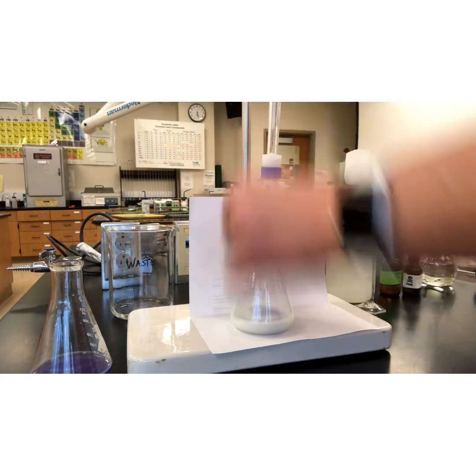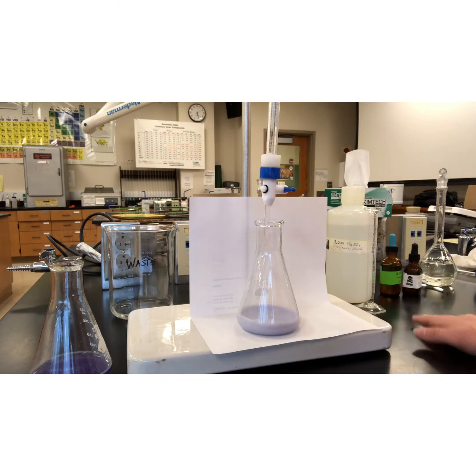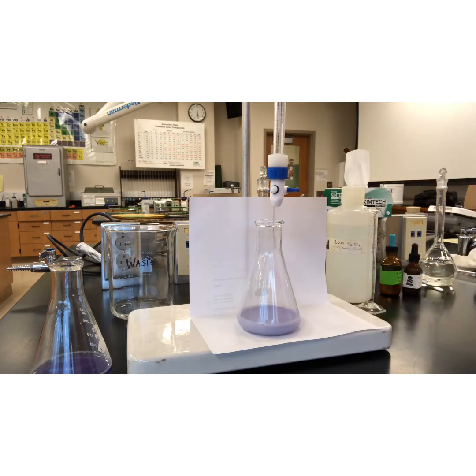Let's slow that down. Stop, stop, it's turning purple. Oh yeah. Got our color change there. And let's see, 18.5, 18.6, 18.7. I'm reading the meniscus and its little lines. 18.70. 18.70 milliliters.